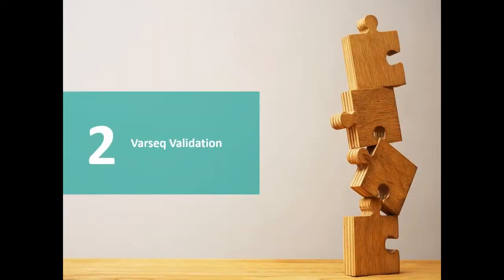After these slides about what CNVs are and how they are analyzed, I would like to talk about our validation of VarSeq, showing you what our criteria are for the software. On these slides, I will present the ideas at the level of sample selection, as well as which regions we have used.